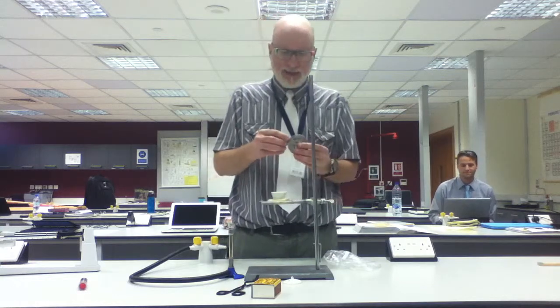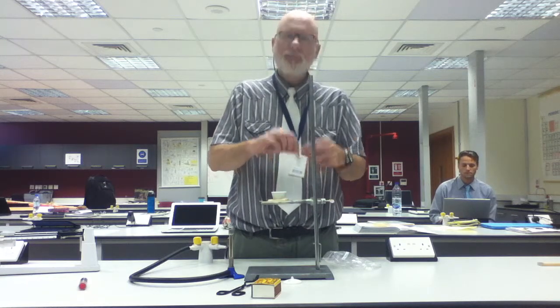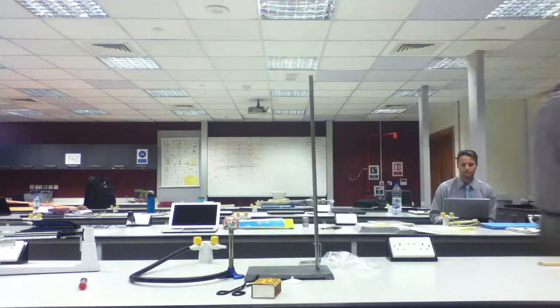I'm going to pass a piece of this around. Magnesium looks kind of like aluminum foil, but much more rigid. This is magnesium metal. I'm going to come over here and give you a little bit of a look. Can you see that? Up and to the right. Up? Yeah, there. Is that good? That's magnesium metal. Can you see the texture of it? Down. Yeah, there. Good? Okay, that's magnesium metal. I'm going to pass that around.